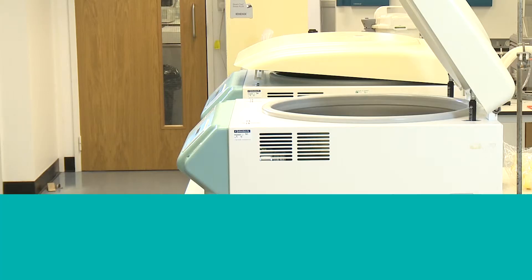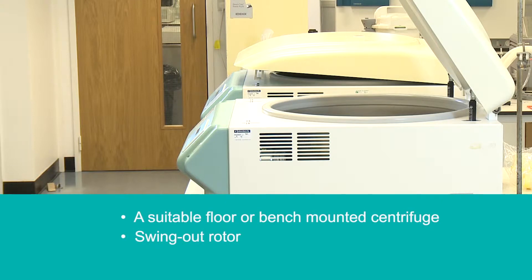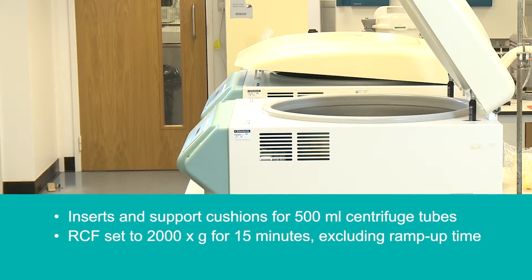The recommended setup is a suitable floor or bench-mounted centrifuge, swing-out rotor, inserts and support cushions for 500 milliliter centrifuge tubes. RCF set to 2000 times G for 15 minutes, excluding ramp-up time.